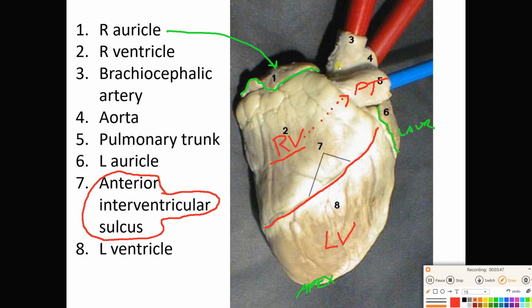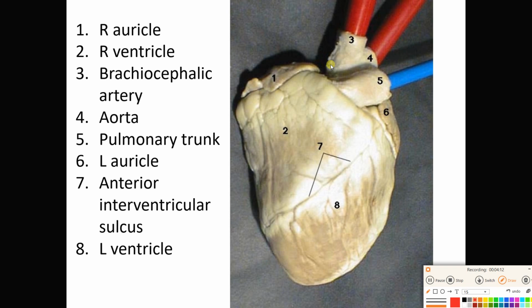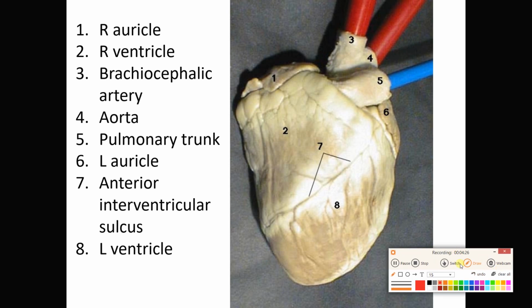Sometimes it'll be cut short, so there'll only be one. But in this case, we got two. The one that is more to the sheep's right is going to be that brachiocephalic artery. So number 3 right there is the brachiocephalic artery. And it is actually coming off of this guy right here. This is actually your aorta curving right there. Now, sometimes on these sheep hearts, the aorta is cut low and early, so you don't see the brachiocephalic coming off. All right, so that is pretty much everything that we can see in the front.